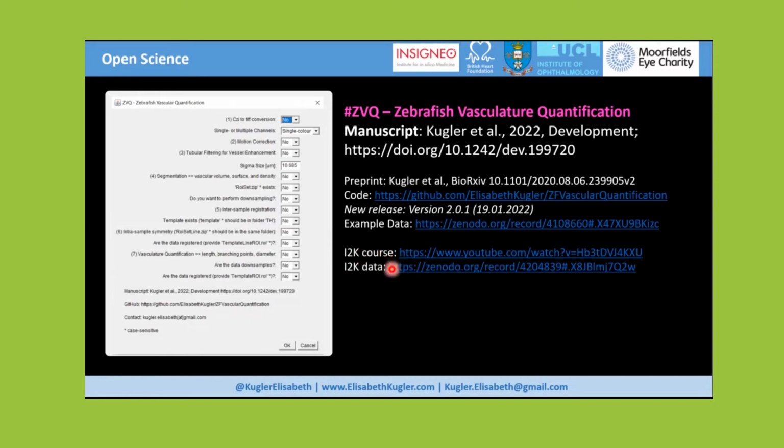But I just want to highlight again, it's implemented into Fiji as Fiji macros, but I also implemented it as one workflow with a graphical user interface, which is shown here. And this is particularly for users who have no computational background, so they don't really need to do anything other than select some boxes, such as, for example, do you want to perform segmentation? Say yes, say okay, and then select the folder of interest, and then it will iterate over the folder.